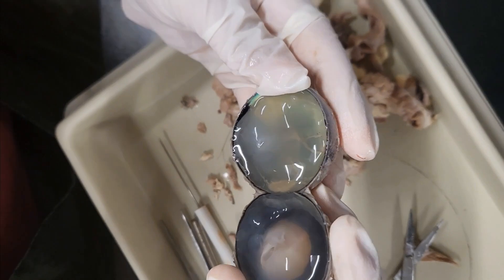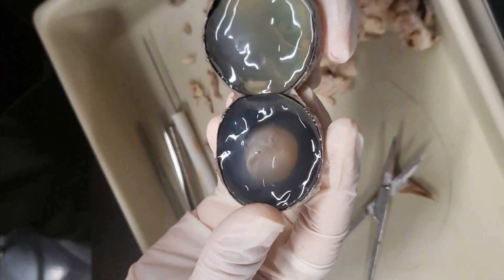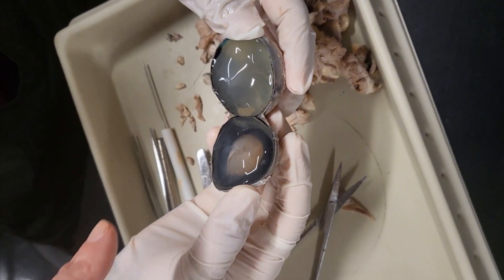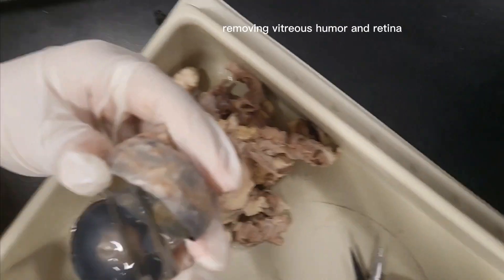You can see the retina right there — and what's this white thing in there? Oh my god, that's the lens, and you can see the vitreous humor. Yeah, yours is in good shape. This is the front.